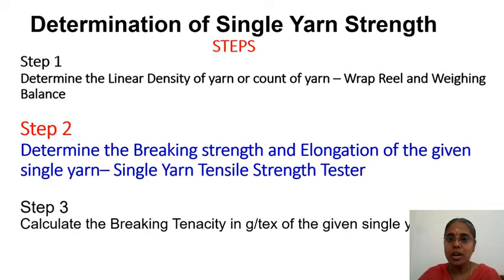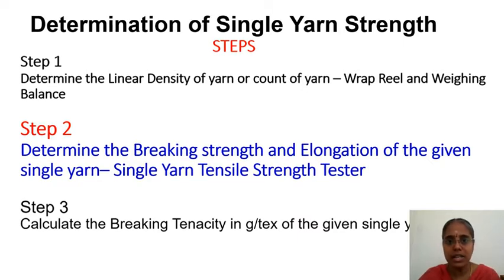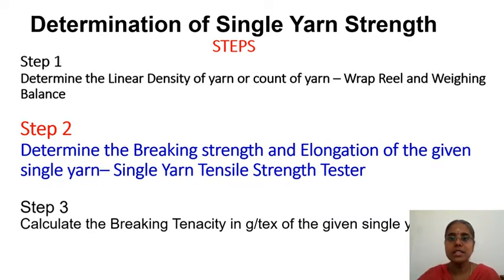The first step is now complete — the count has been determined as 14.95 tex using the wrap reel and weighing balance. The second step is to determine breaking strength and elongation using the single yarn strength tester. We are using a CRE (Constant Rate of Extension) type electronic tester. Other types include CRT type mechanical and CRT type motorized instruments.